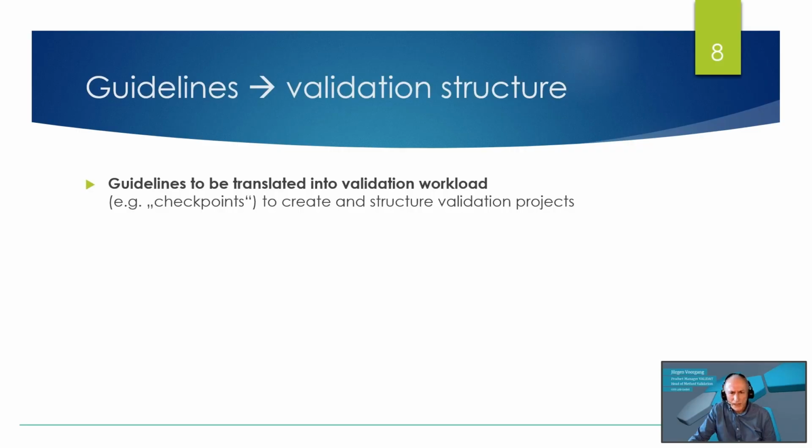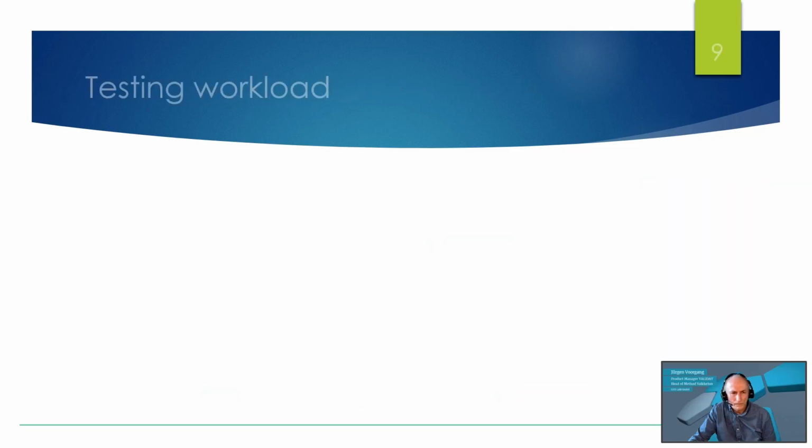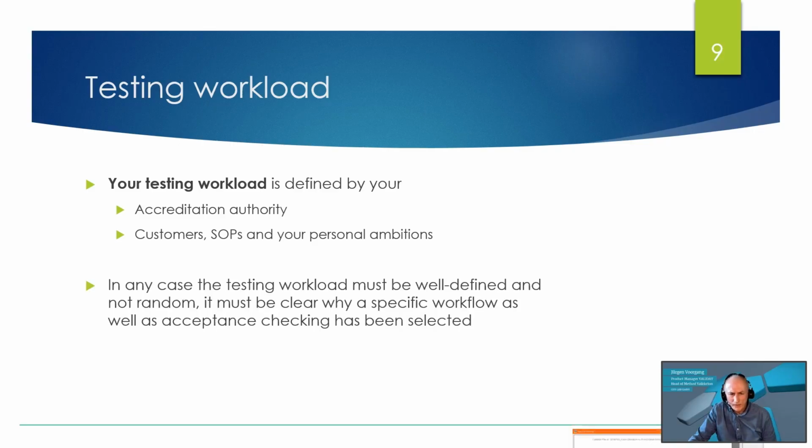Guidelines need to be translated into validation workload. We call them checkpoints to create and structure validation projects. Your testing workload is defined by your accreditation authority, your customers, your SOPs, or your personal ambitions.